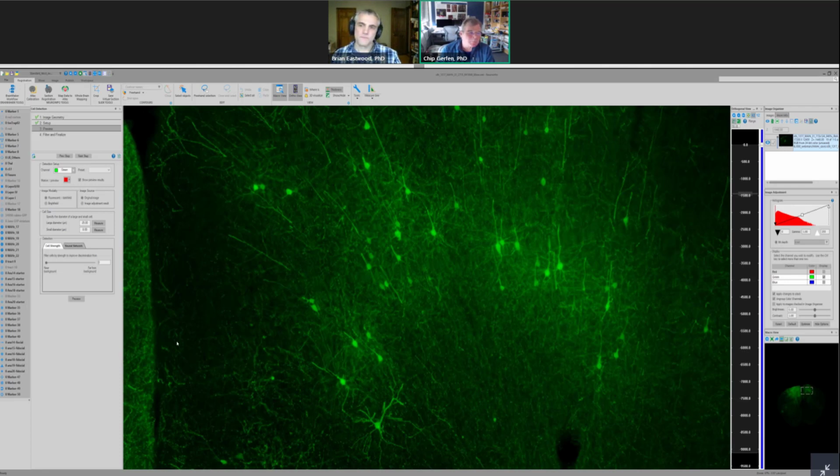The other nice thing about this mathematical filter is that it's scalable. And so we can complete a scale space analysis of the image that considers the size and the strength of the features in the image. Those parameters that you were just adjusting, the cell size range, are part of that scale space analysis. As you were doing, you might want to hit preview and start to see some of the objects that we're detecting.